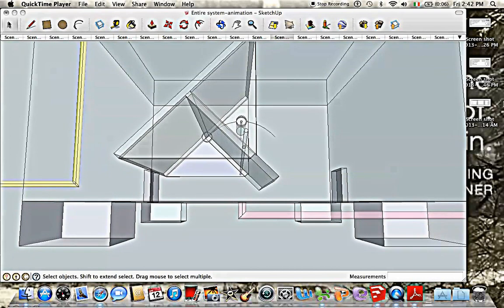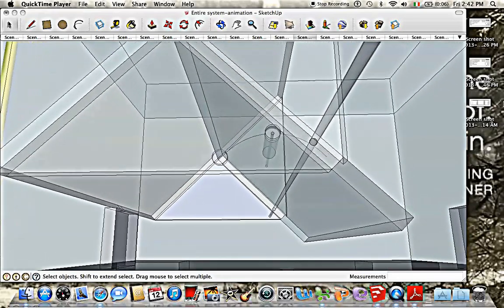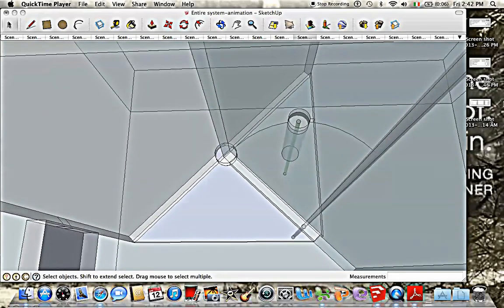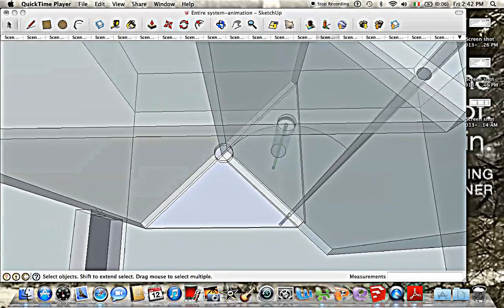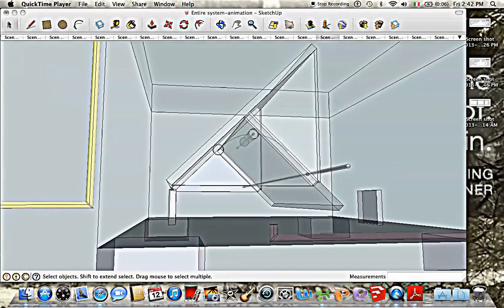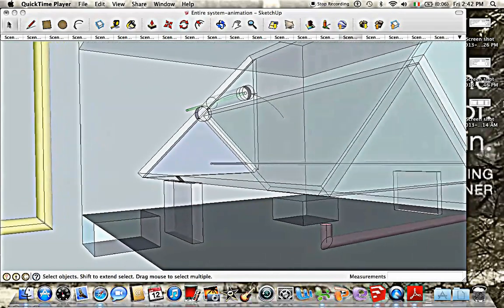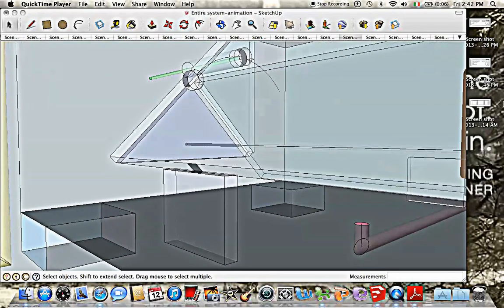As the biogas enters, it is forced into the cavity that we can clearly see here. The gas will eventually build up to a level which will cause the bucket to tip as the bucket pivots on the axis seen on the right. The bucket will tip from left to right, and the gas will start gathering again on the right, and the bucket will tip back from right to left, and this continuously happens.